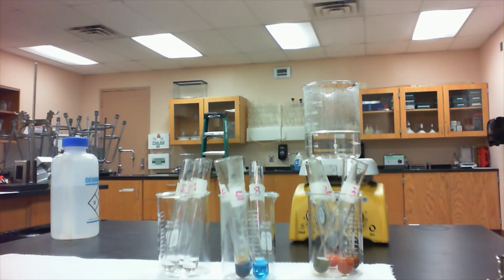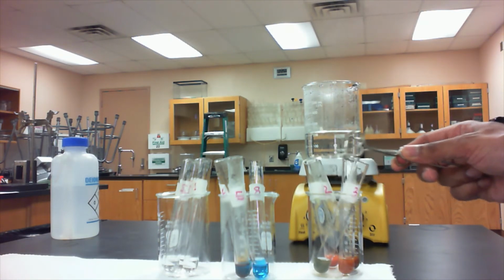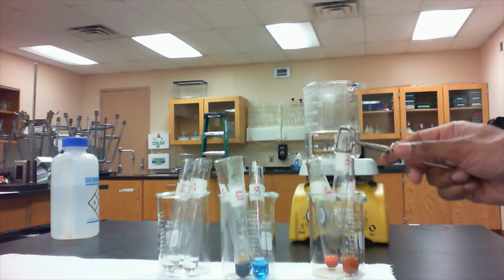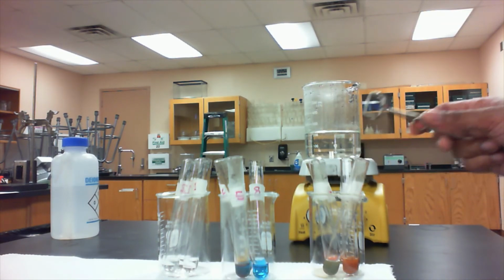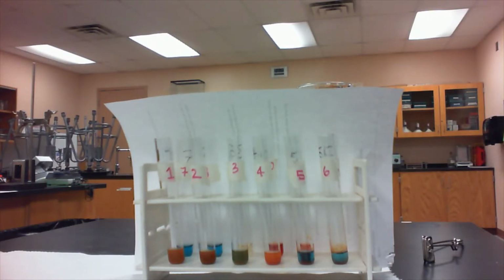So after 5 minutes have elapsed, I've gone ahead and removed test tubes 1 through 6 from the boiling water bath using a test tube holder. And what I'm going to do next is put in the remaining 6 tubes, test tubes 7 through 12, into the boiling water bath as well for 5 minutes. Okay, so I went ahead and I removed the remaining 6 tubes from the boiling water bath, and I allowed them to cool down.